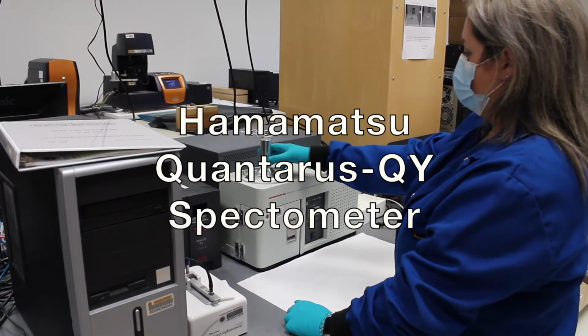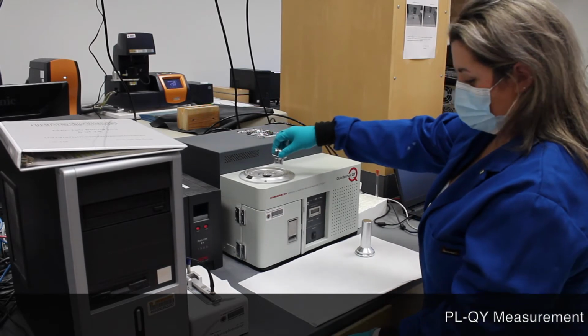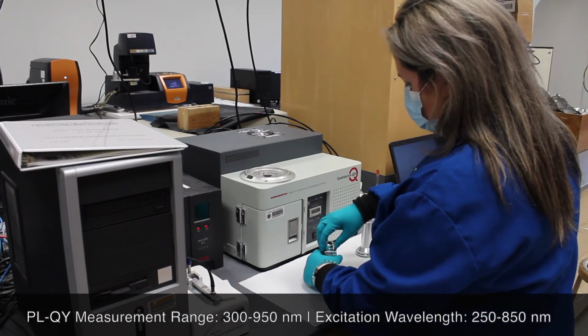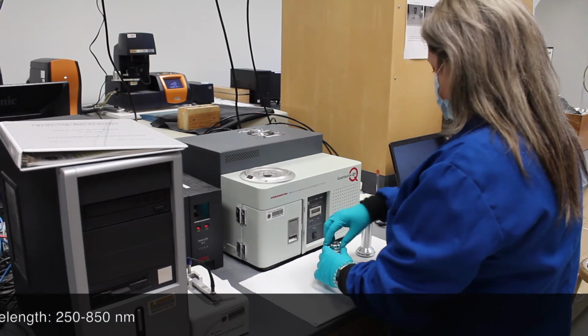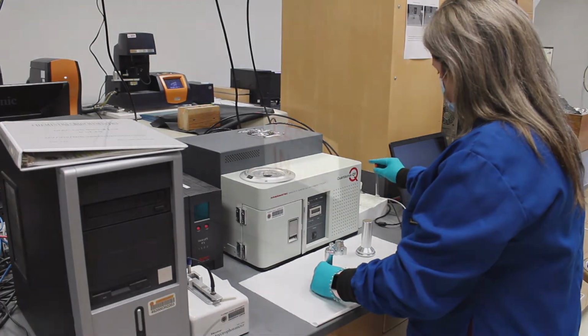The quantum yield spectrometer is a fluorimeter used for measuring photoluminescence absolute quantum yields. It consists of a xenon lamp light source, integrating sphere sample chamber, and CCD detector. Additionally, different color measurements like chromaticity, color temperature, and color rendering index can be performed. It can accommodate liquid, powder, solid, and thin film samples.